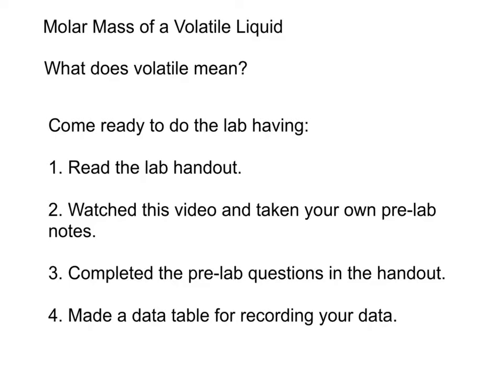After you've finished working on the worksheets using the ideal gas law and the equations related to the ideal gas law, you're going to do a lab where you find the molar mass of a volatile liquid. First of all, what does volatile mean?